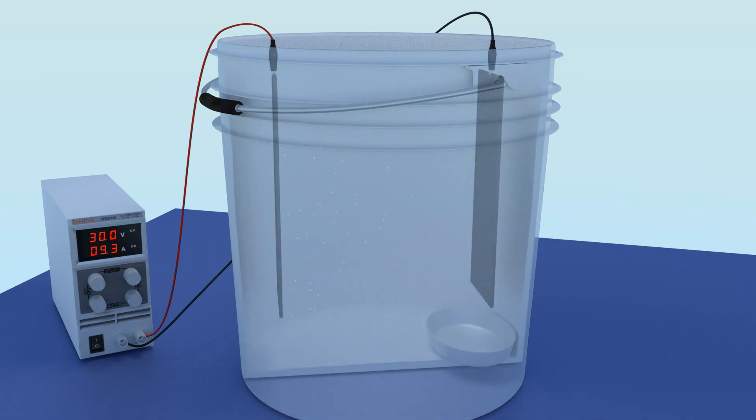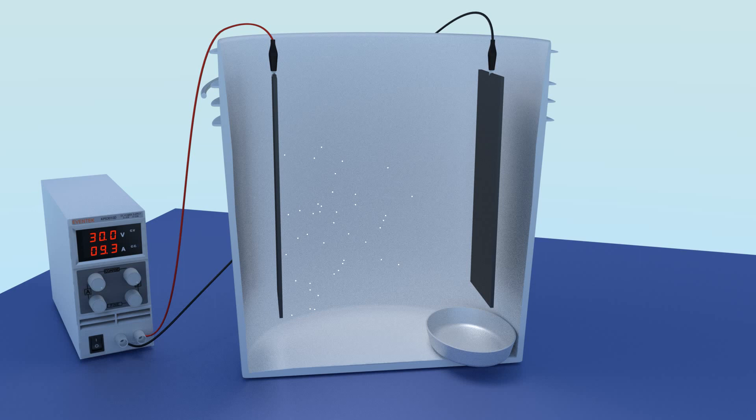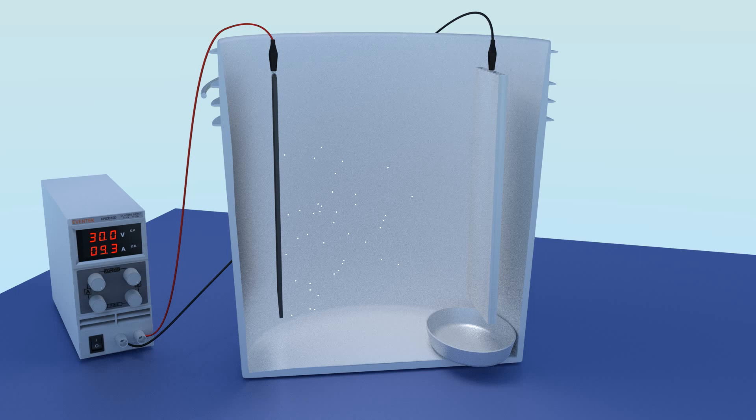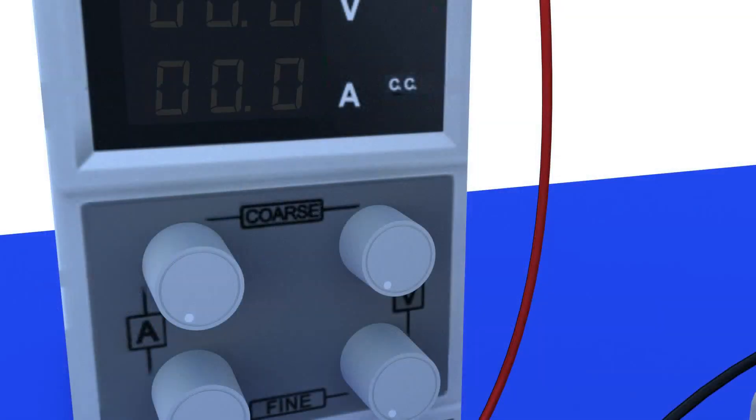And either a dish or a shallow bowl. This will catch any metal that falls off your cathode. If you are going to use this process on a regular basis, you might want to purchase an anode bag, using it instead of the bowl.